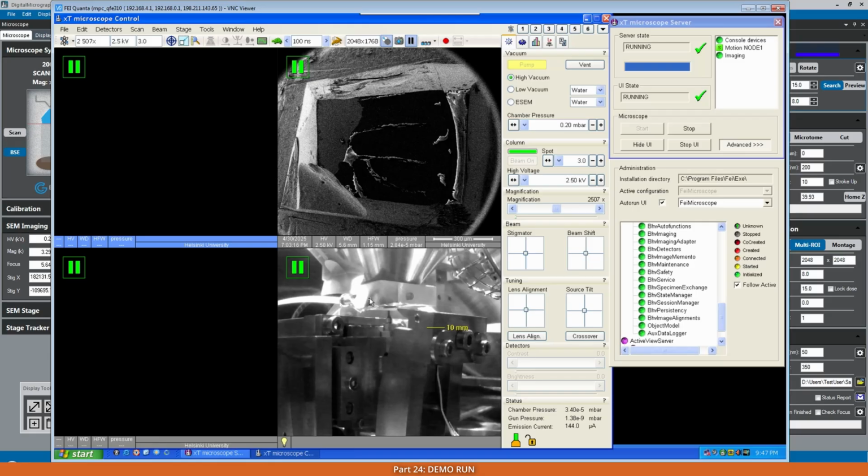As a result of this, you may burn the preamplifier on the system, and the only way to deal with this is to make sure that you turn off the beam, and after that change the mode or change the pressure.